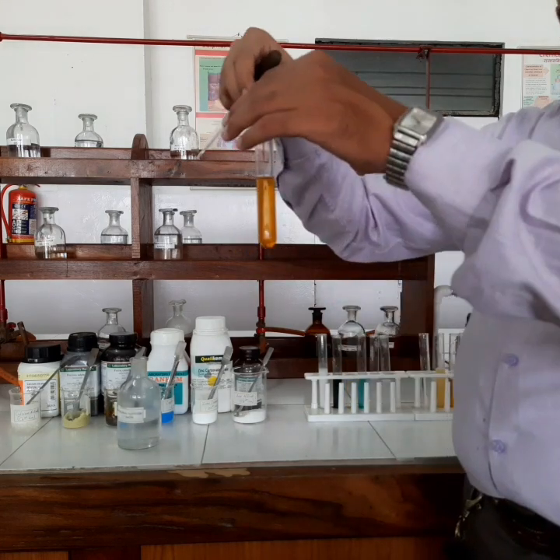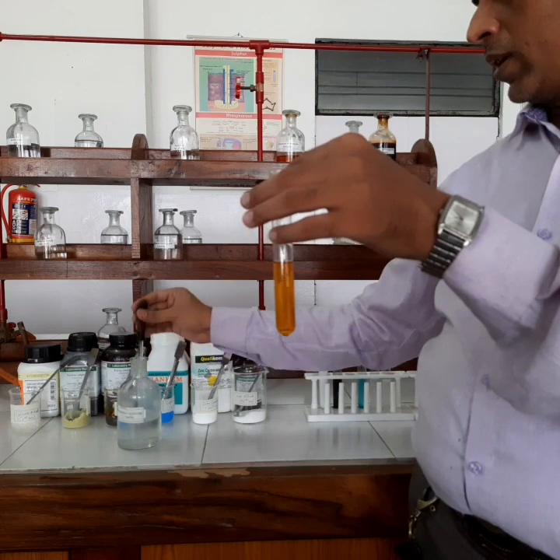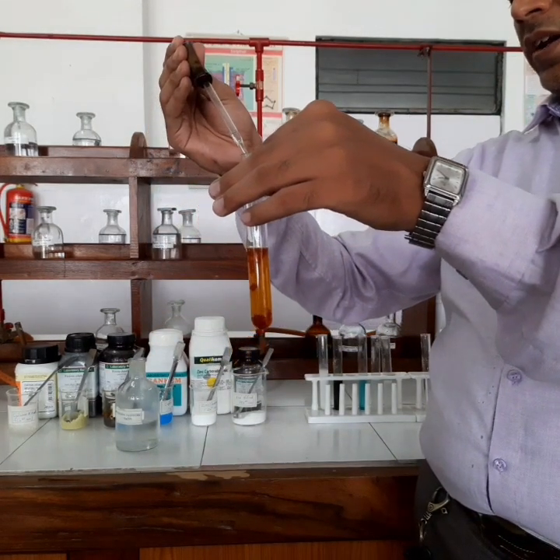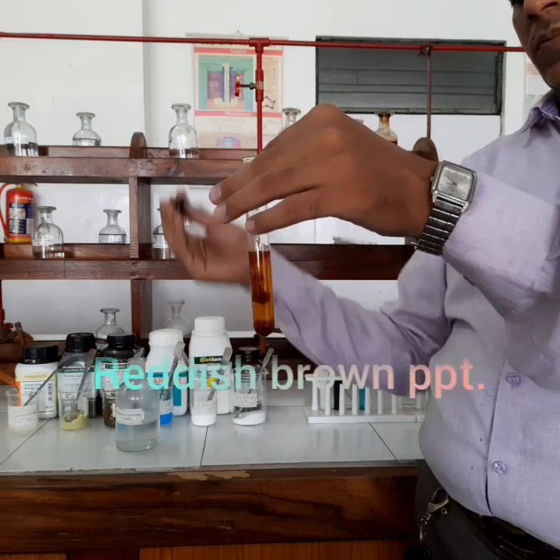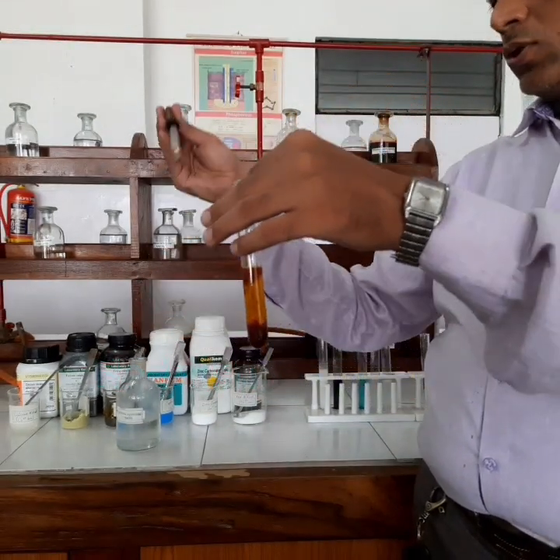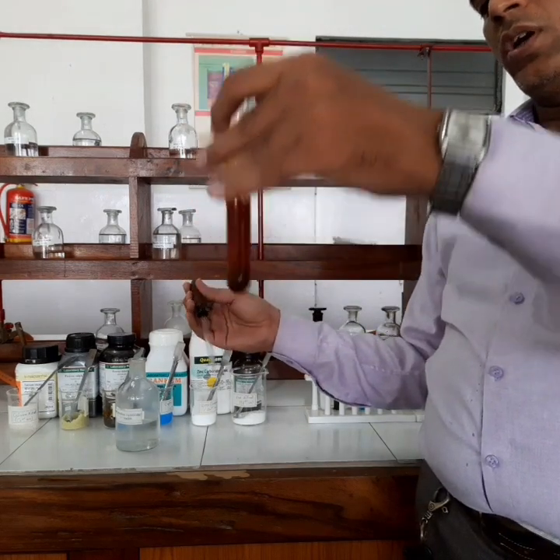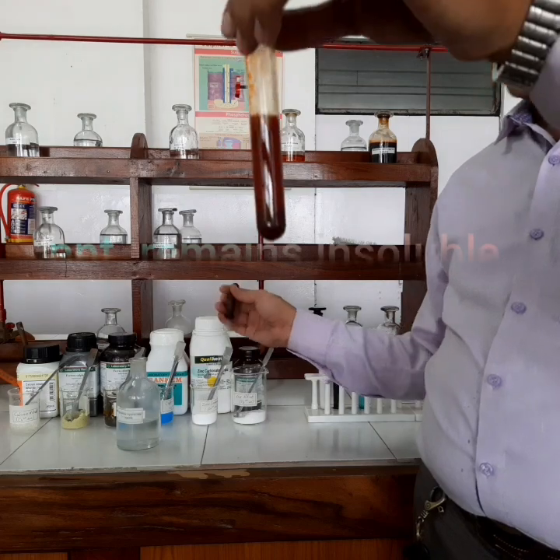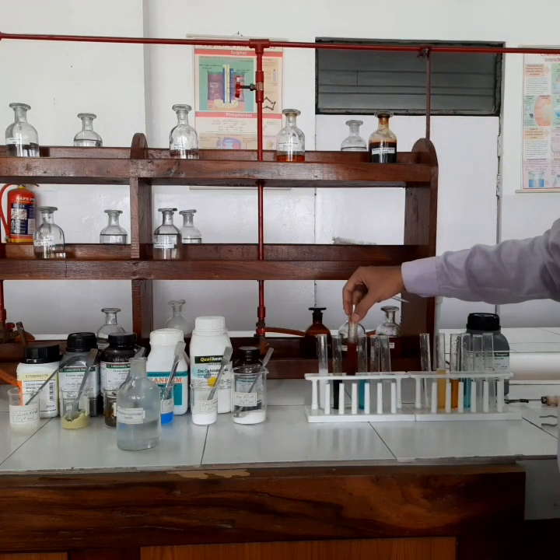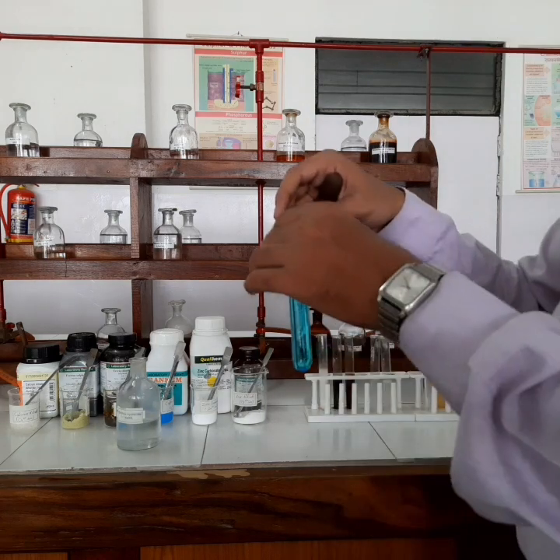Now this is the aqueous solution of ferric chloride, and we are going to test for ferric ions with this solution. I am going to add NaOH firstly in small quantity, and you can see a reddish brown precipitate is settling down. Now I am going to add NaOH in excess to see about the solubility. Still, on adding NaOH in excess, the precipitate has not become soluble. So the precipitates of calcium hydroxide, ferrous hydroxide and ferric hydroxide were all insoluble in excess of NaOH also.